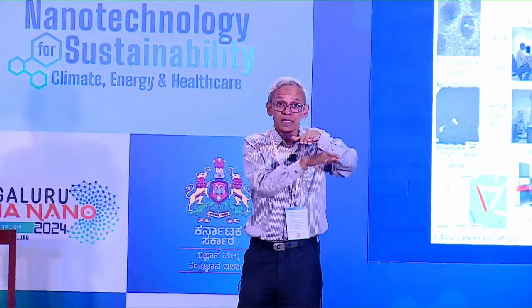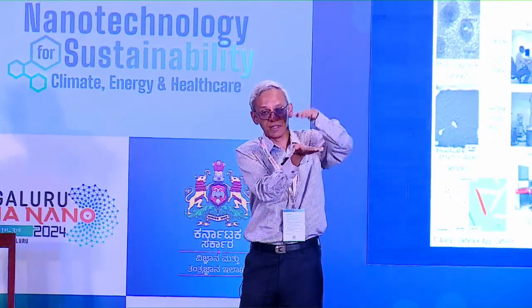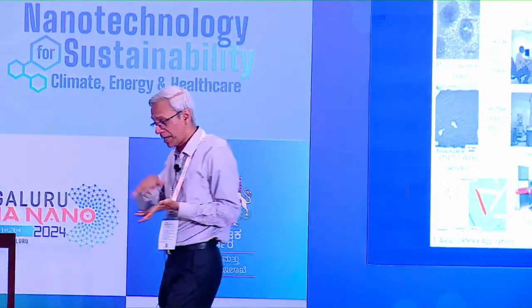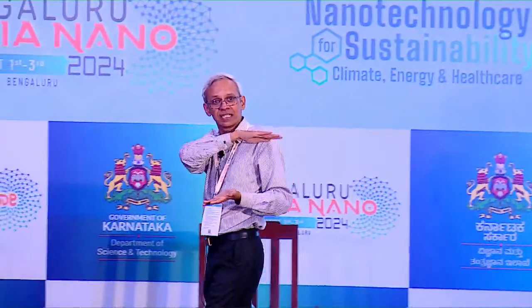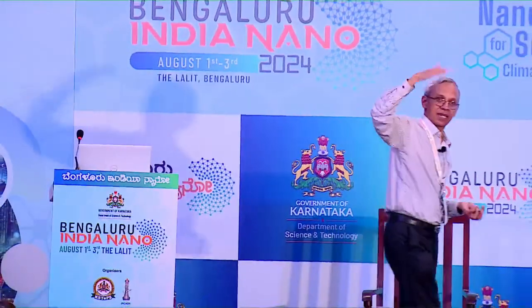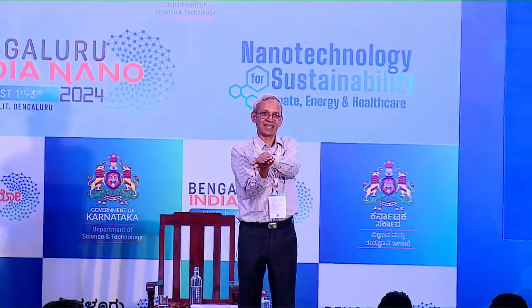The thickness now is not, we are actually making perpendicular to the layers. It has to be thin. You understand, you're making a cross-section specimen. So the challenge is to actually make a thin specimen, basically cutting the specimen, right? If you can think of it like a multi-layer cake, right? You're basically making a thin slice and then looking at it along the other edge, right?